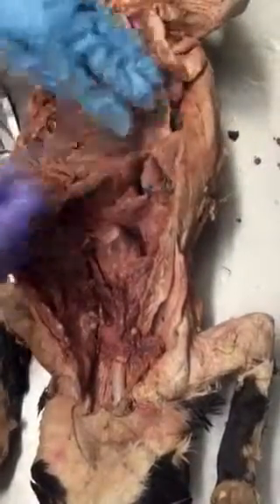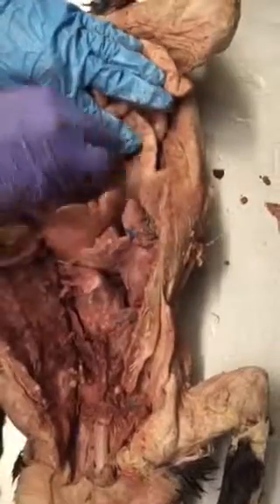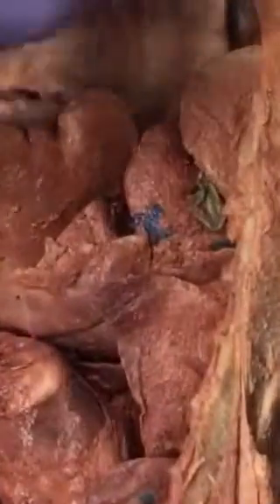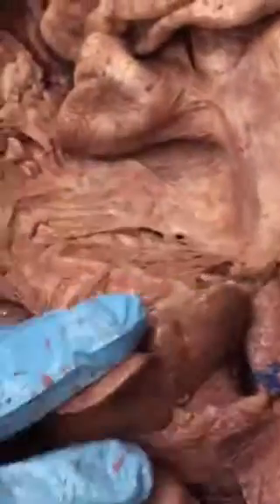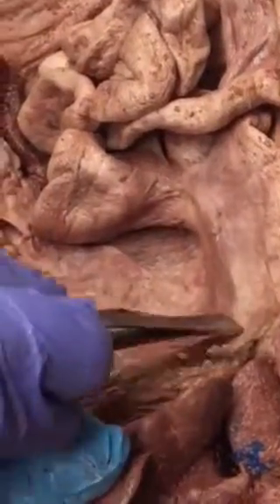Let me grab this. Sometimes it helps to wipe things. So you see this chunky looking stuff that looks kind of like ground beef or ground turkey? That is the pancreas.